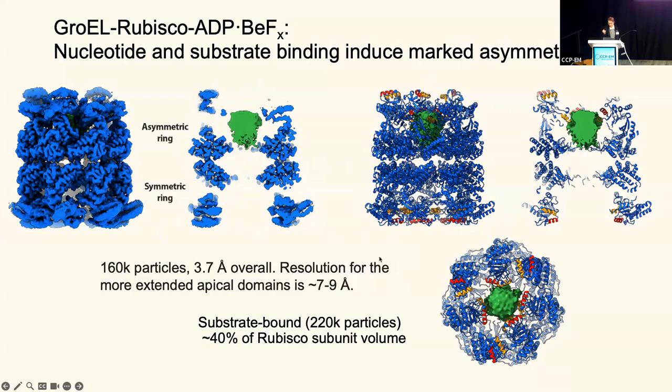And the ring that binds the substrate, this great green blob is the rubisco, it turned out that about three or four of the subunits were still binding the rubisco. The hydrophobic part was still facing the rubisco, but the other two or three were actually elevated completely in an orientation where the hydrophobic patch was in a potentially GroES acceptor state. So the GroES has mobile loops which dock down on top of those sites, and so it takes away those sites from the bound substrate.